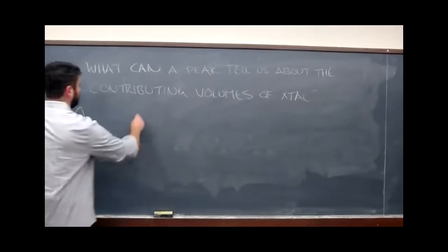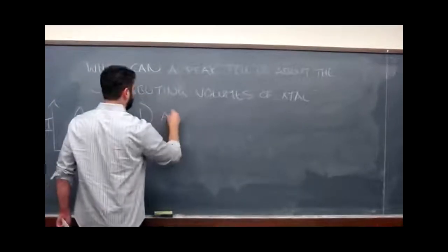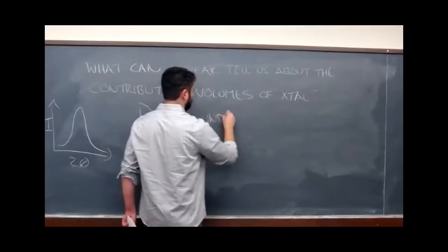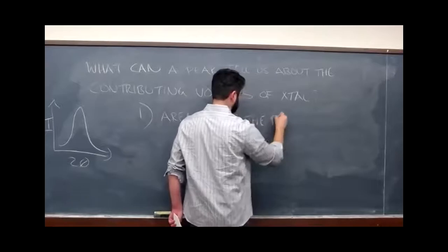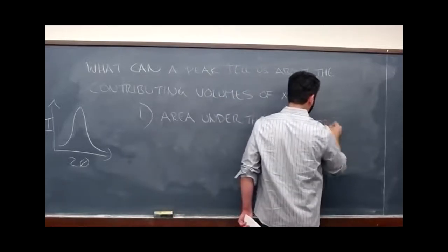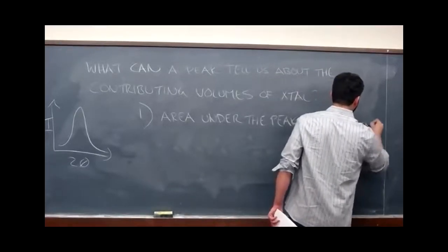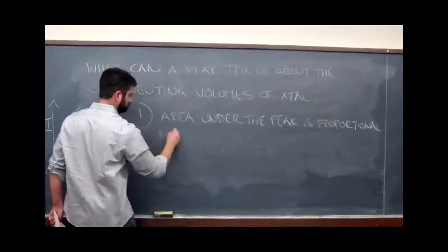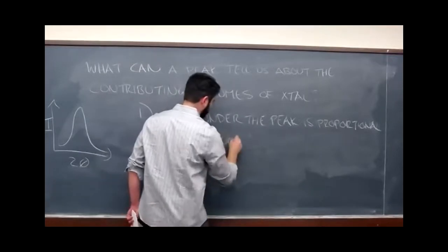Here's our peak. So the first thing is that the area under the peak is proportional to the volume of crystal participating.